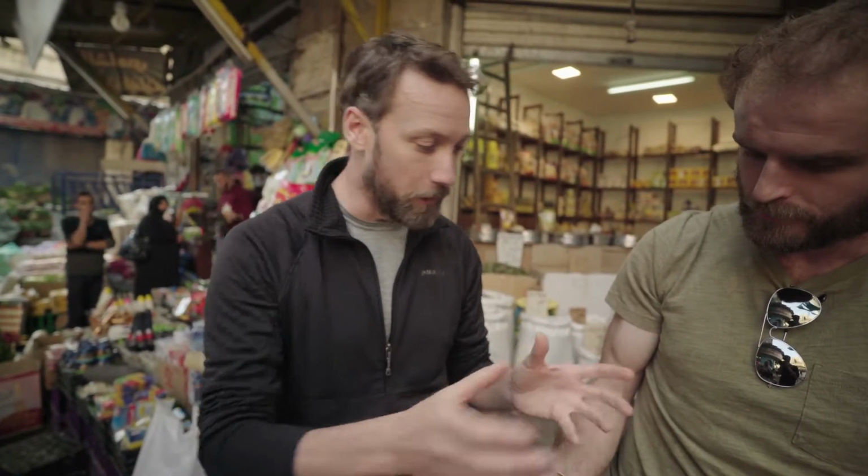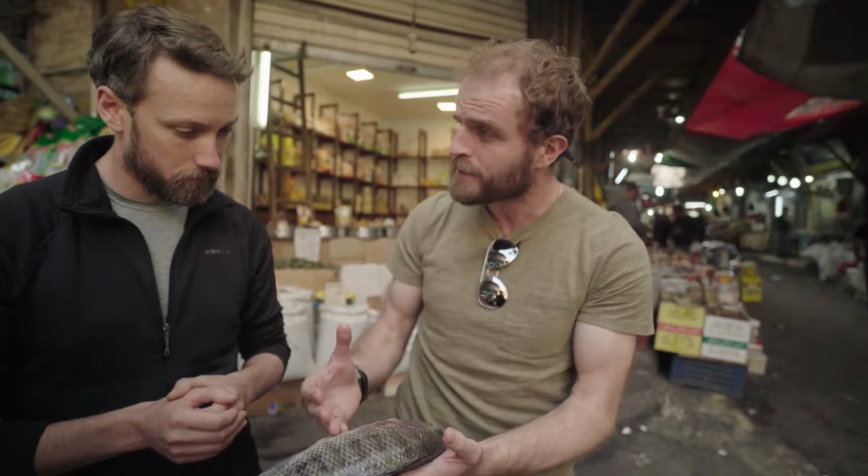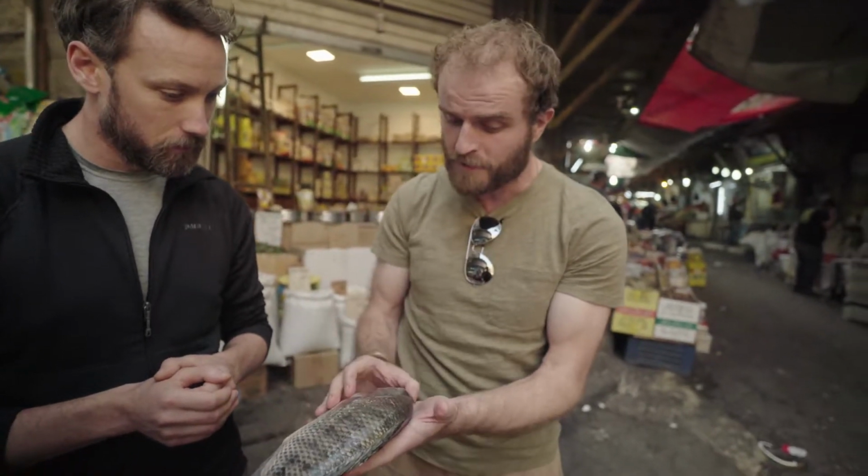Do we need to cut this up to learn about it, or can we learn anything from a fish looking at it as it is? Well, we could go diving in, right? We can learn an awful lot more about an animal before we even go inside it. We can learn about how that animal moves, how an animal breathes, maybe even what the animal eats from its mouth parts.